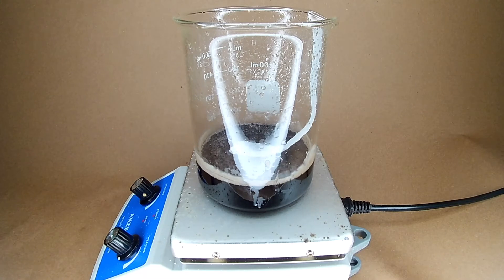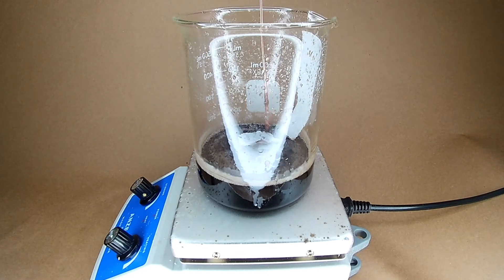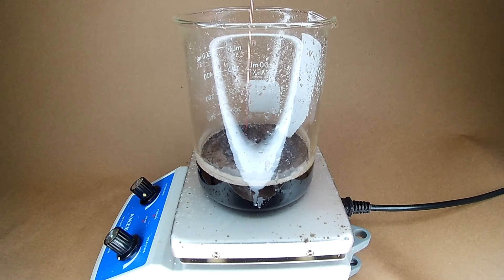Here, it just appears to be floating on the surface. I'll have to push the paper towel down into the solution to dissolve more of it.